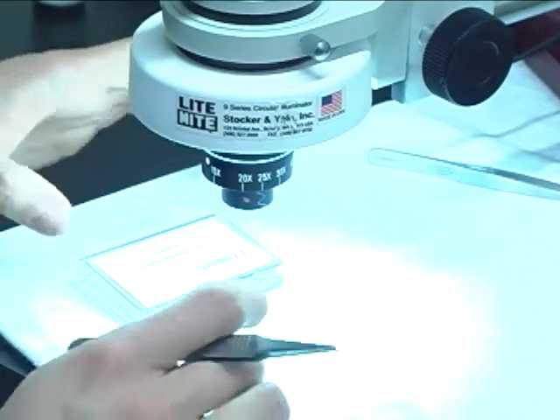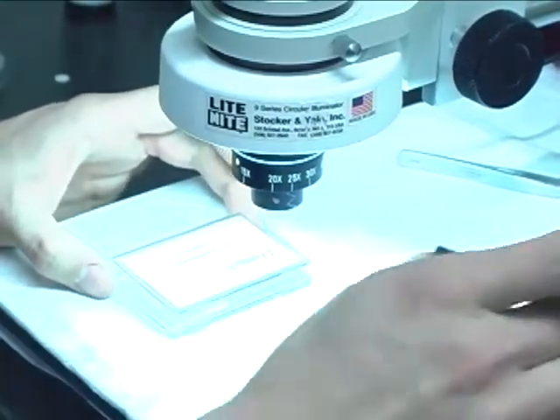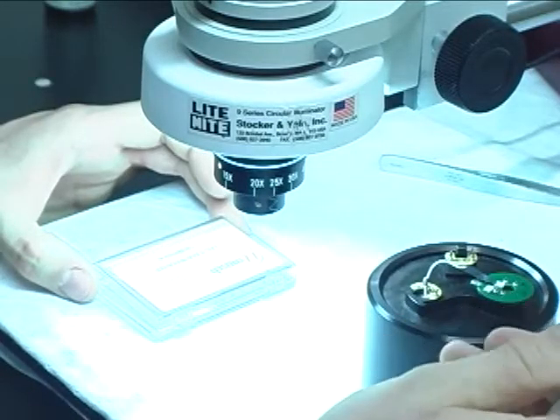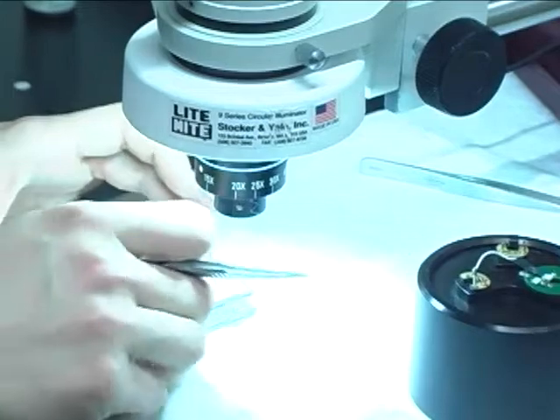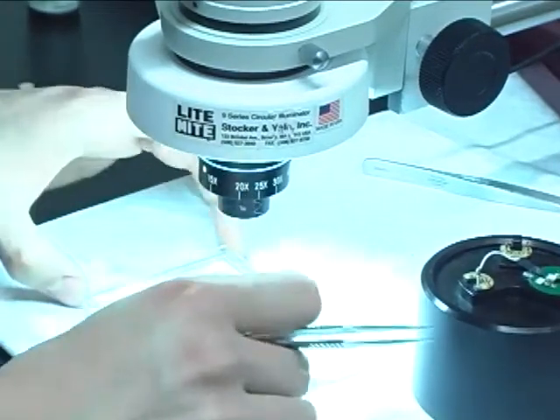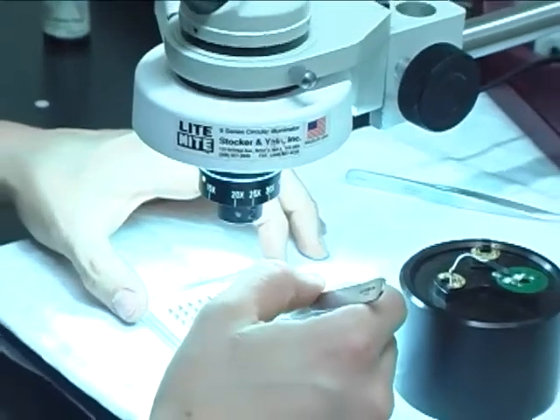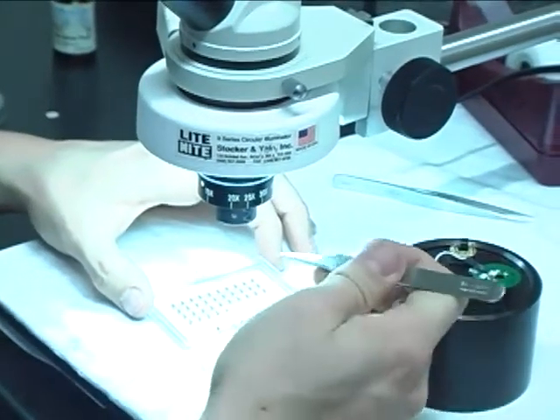Next we're going to prepare and mount our cantilever onto our mount for the instrument. So since these particular chips come with three individual cantilevers and we're doing electrical measurements, we must knock off two of the excess tips.